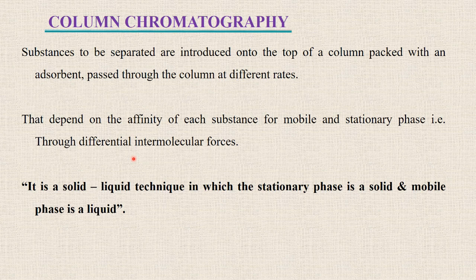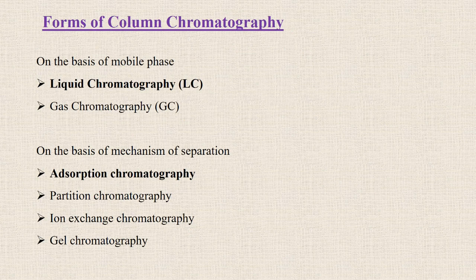We are talking about the conventional column chromatography. We are not talking about the latest techniques of gas chromatography or HPLC, which are also the latest techniques of column chromatography. We are talking about primitive column chromatography, which is a solid liquid technique. Stationary phase is solid and mobile phase is liquid.